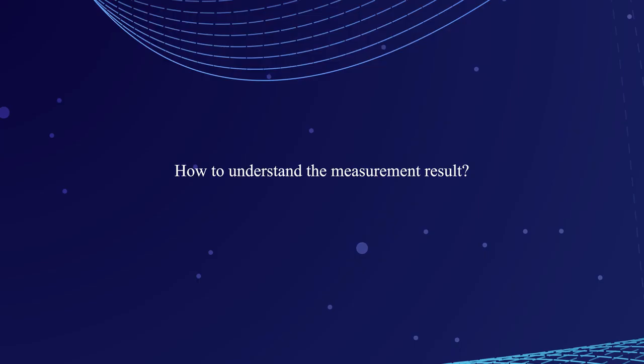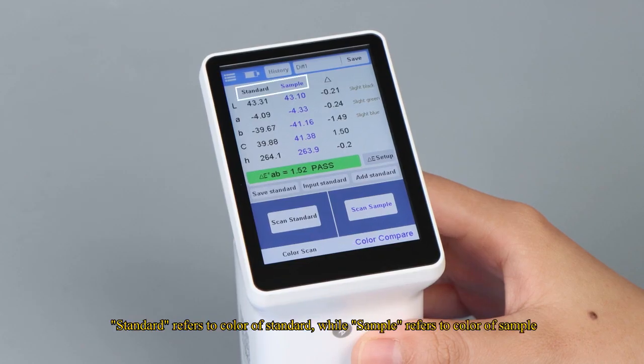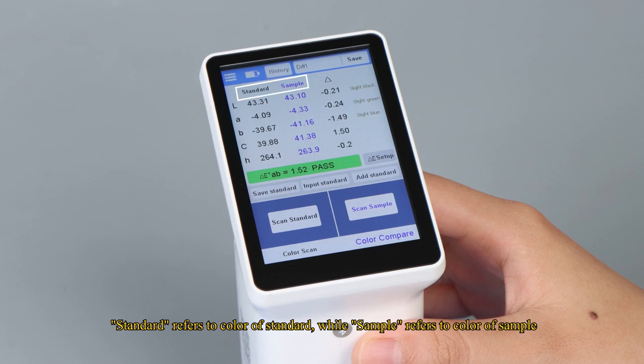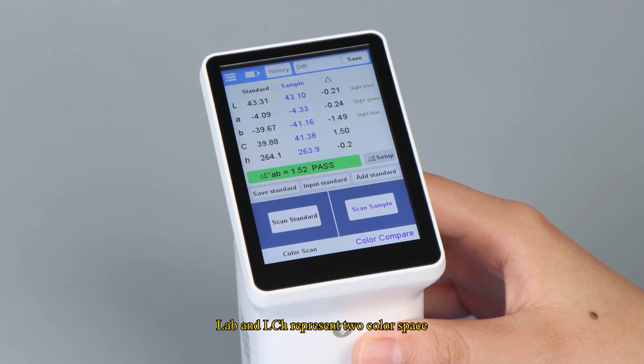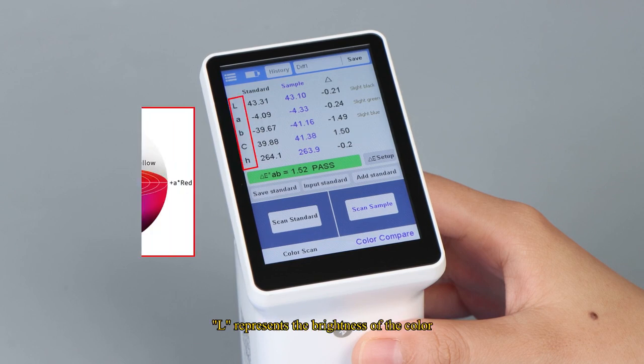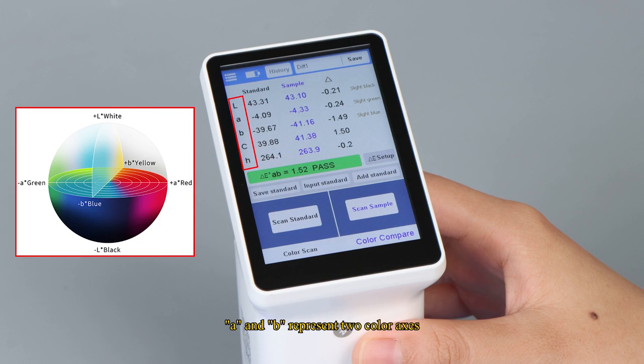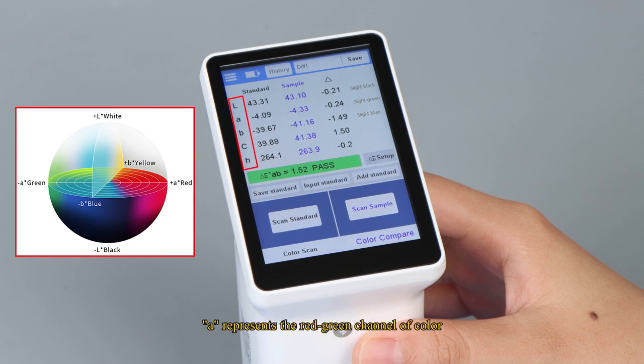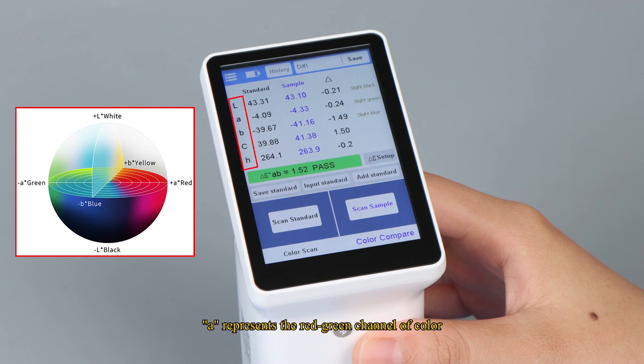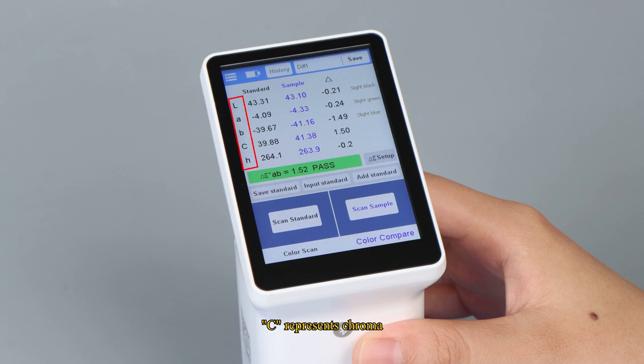How to understand the measurement result? There are some parameters on the screen. Standard refers to color of standard, while sample refers to color of sample. L, A, B, and L, C, H represent two color spaces. L represents the brightness of the color. A and B represent two color axes. A represents the red-green channel of color. B represents the yellow-blue channel of color. C represents chroma. And H represents hue.